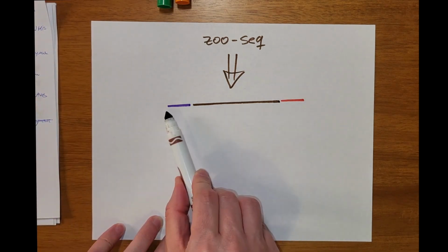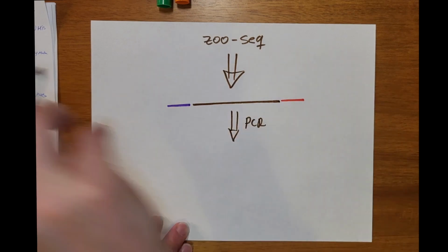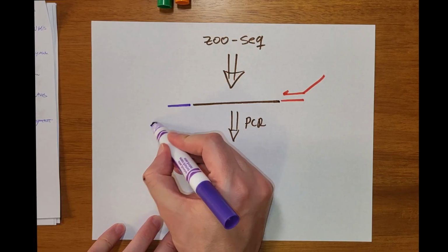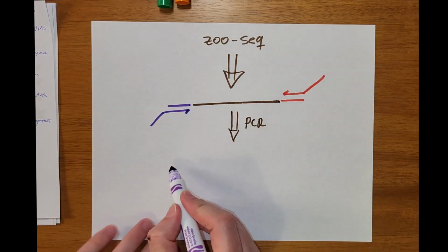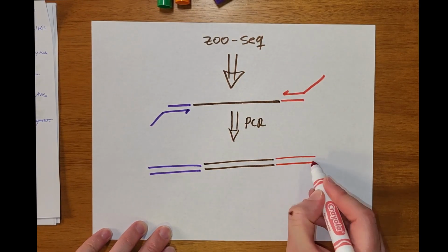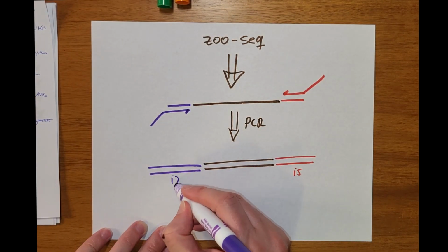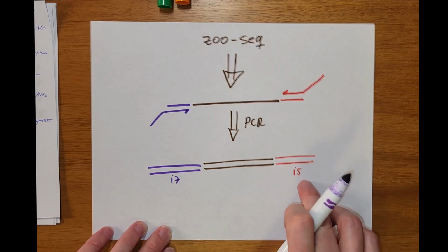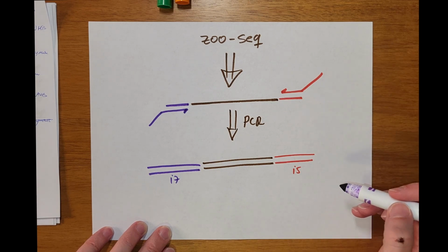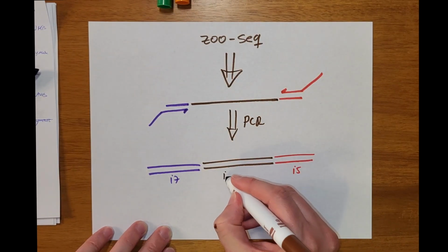You will have these fragments with these primers, and then you will amplify these by PCR using specific primers that bind to this bit here and to that bit there, and you'll end up with this sequence flanked by these extended primers. These primers are typically the I5 and the I7. So you will hear about these sequences. And we will dive a little bit more in detail into how these primers can be changed. So this is the very basic composition of your read. So you have your primers, and in the middle you have your insert.